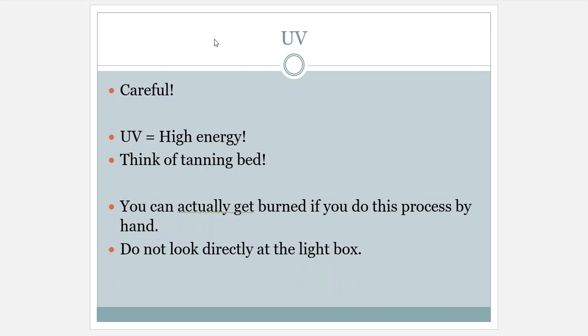All right, in the last video, we talked about how we can see the spots that we want to develop. And I said one thing you can do is look at it with your eyeballs, because it could show up as colored spots or colored bands, and we can sit there and circle them all day long. But very often, it's not as easy as that.